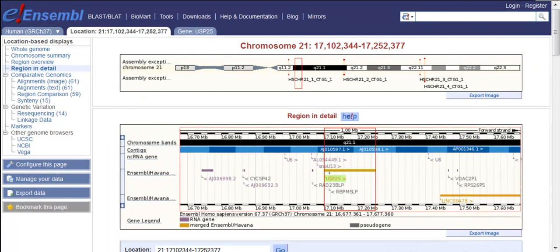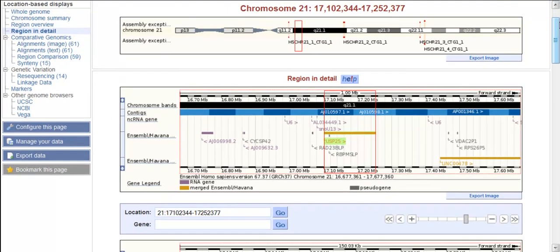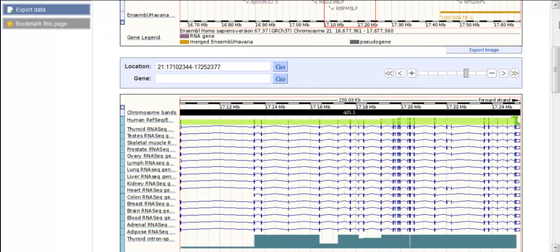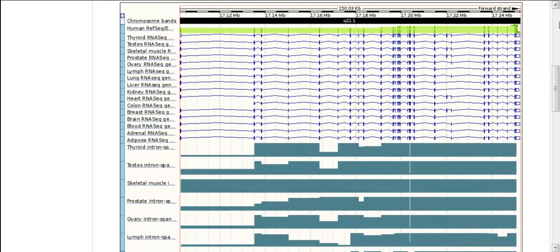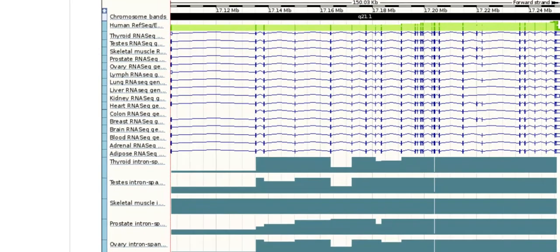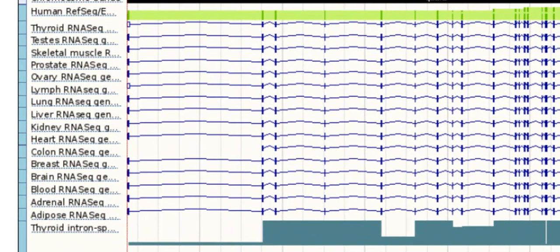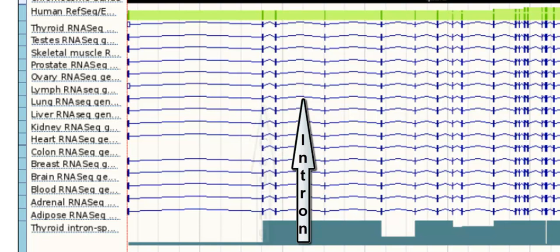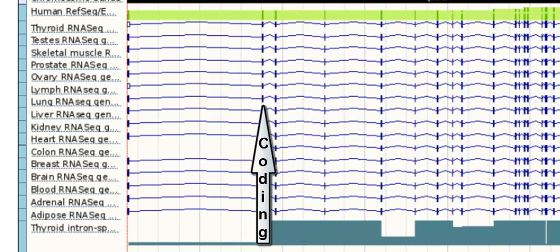The page should refresh and show the new changes. You can see that there are quite a few exons and introns detected by the RNA-Seq studies from multiple tissue types. Just as a reminder, exons are drawn as filled boxes in our gene models and introns as connecting lines. Solid filled boxes are coding sequence, and empty boxes indicate non-coding untranslated region, or UTR.